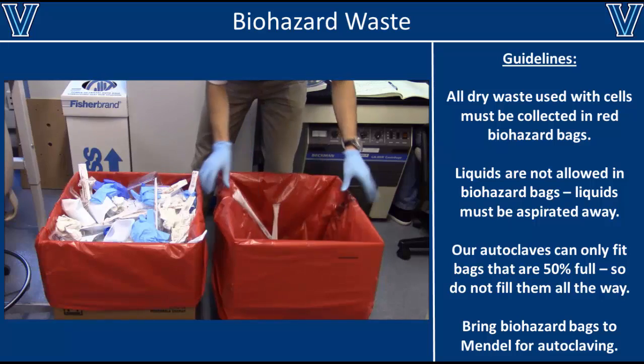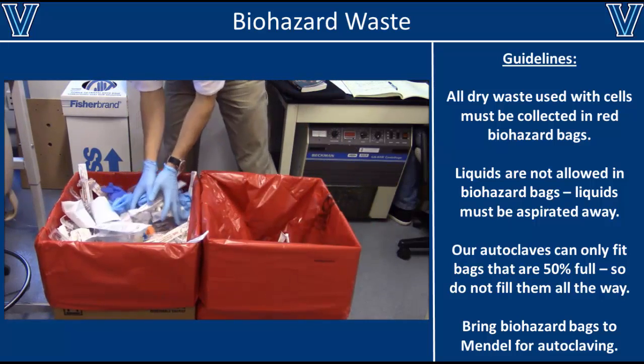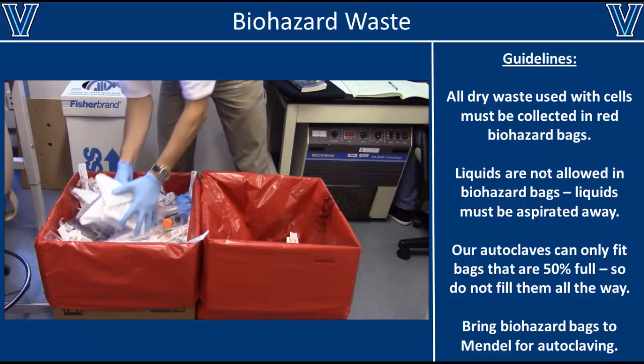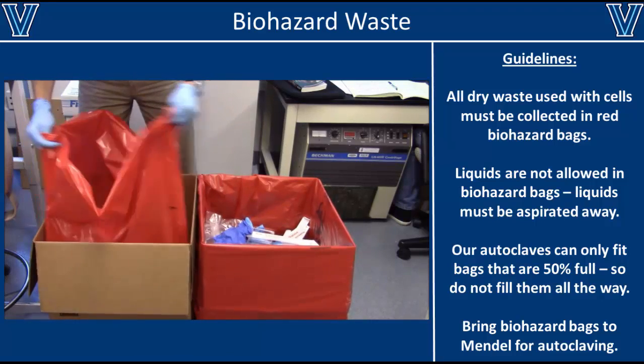Unfortunately, our autoclaves aren't large enough to fit full-size biohazard bags. Therefore, you should always try to seal off the bags when they get about halfway full. If a bag gets more than halfway full, transfer the excess to a new bag.